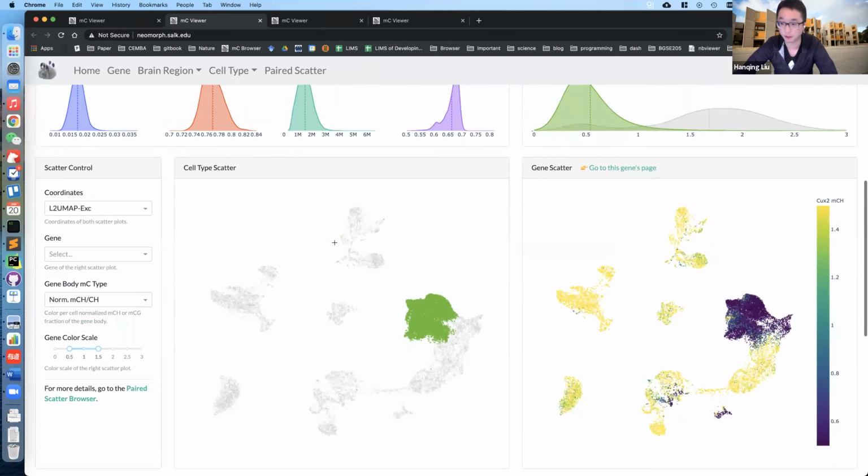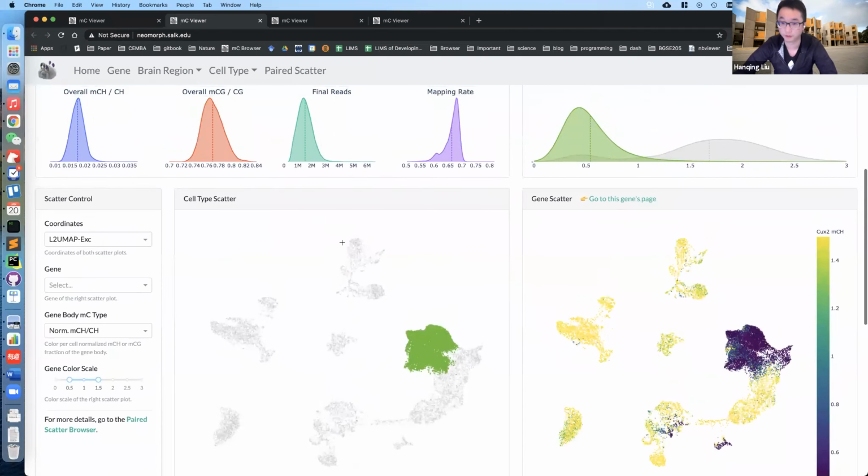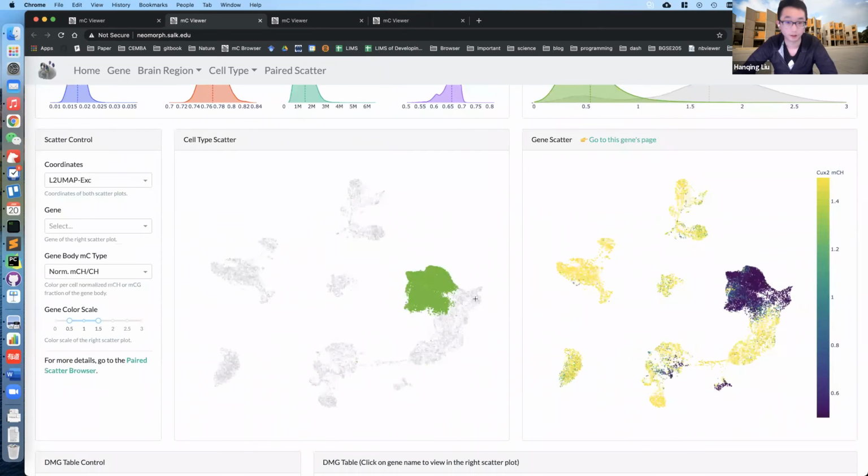And then most importantly, we usually need to annotate or show people how we annotate these cell types by plotting their marker genes. And here, similarly, I'm only subsetting the data to show this particular major type.